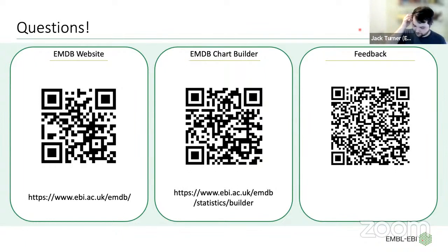Yeah, I guess two parts to this question. You mentioned assemblies there. That's really a holdover from when OneDep was developed for X-ray, and of course with X-ray you have your repeating unit, and that might be the biological unit. The assembly ends up being whatever the biological unit is. I can say when we annotate EM entries, the assembly is just what you give us. It's just what you've built. You don't really need to say much on that.